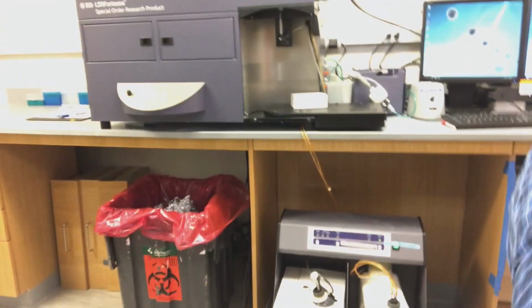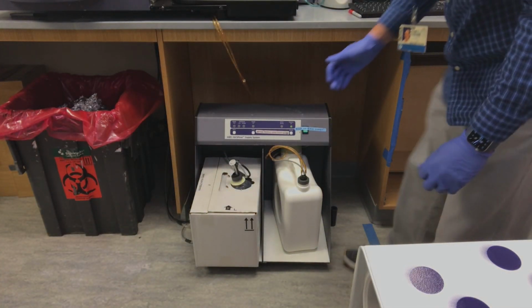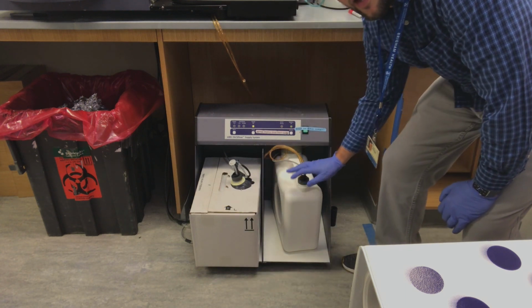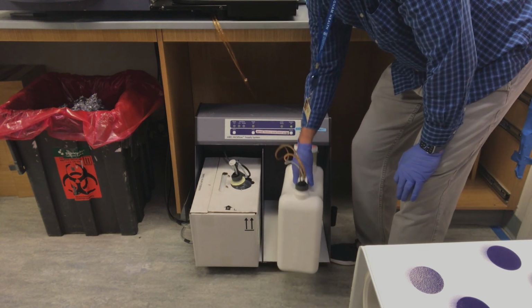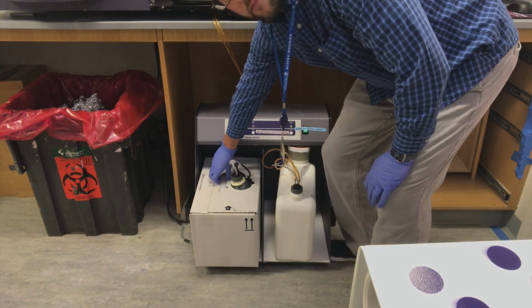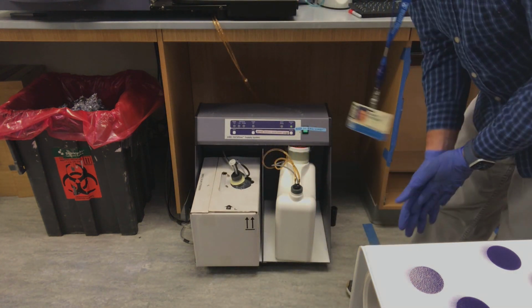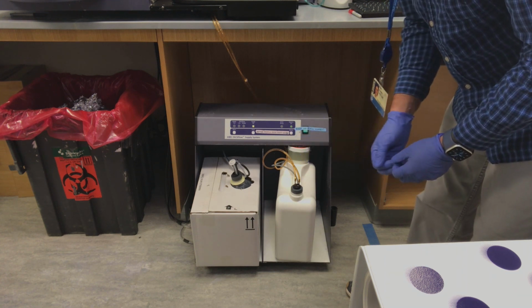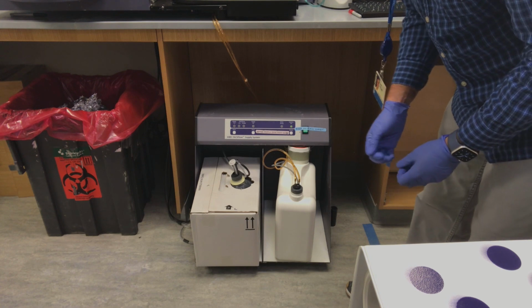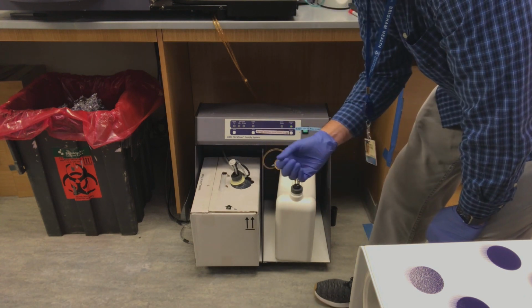As you can see here, we have our wet cart. The wet cart is comprised of our sheath tank and our waste tank. You can test both by weight to see whether or not they need to be replaced or emptied. This tank, the sheath tank, is actually quite empty, so I'm going to replace it as opposed to top off using a graduated cylinder and funnel. If the tank was about 50% or more, please just use the graduated cylinder and funnel.